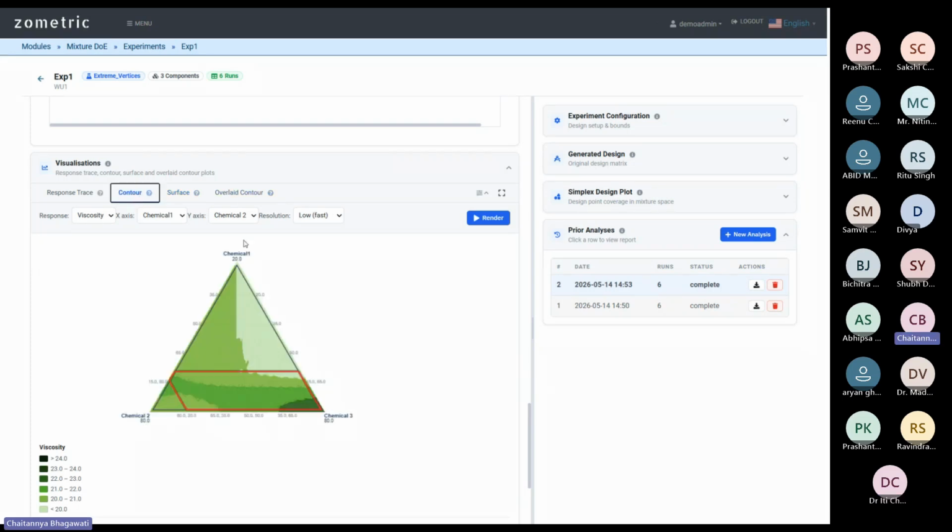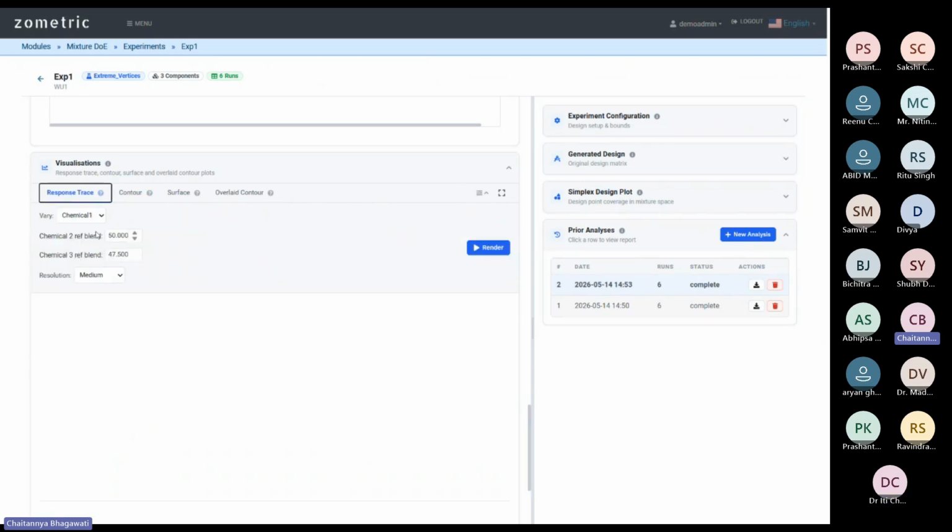And this is really pertaining to Mixture DOE. Now, a lot of graphs, Mixture DOE, most graphs will have the option to be able to select the axis and what hold values you should give for them. But a lot of normal graphs will not have that feature.